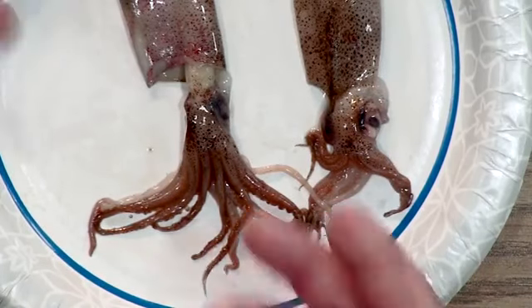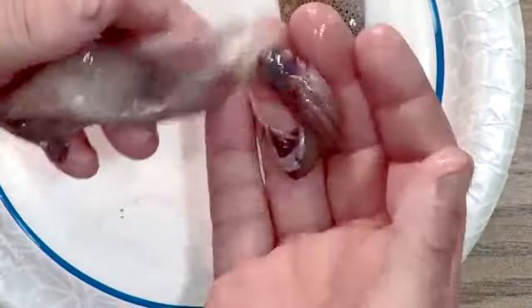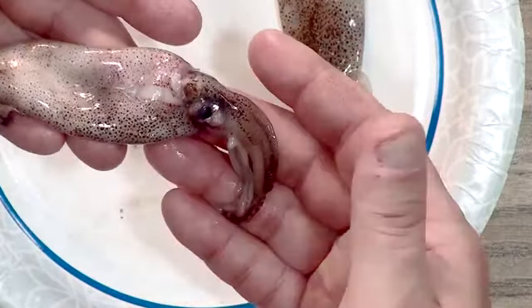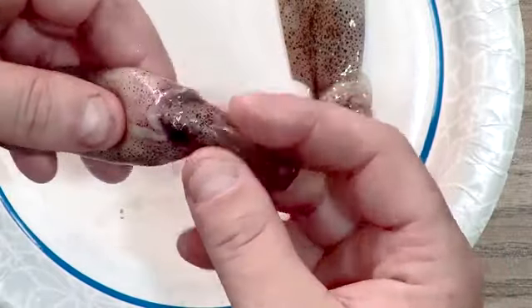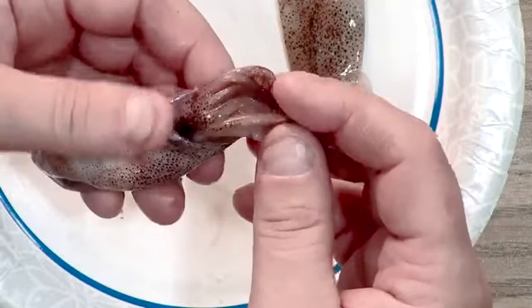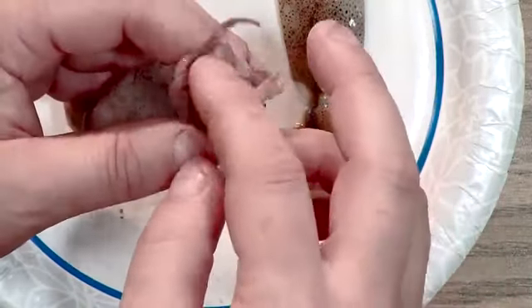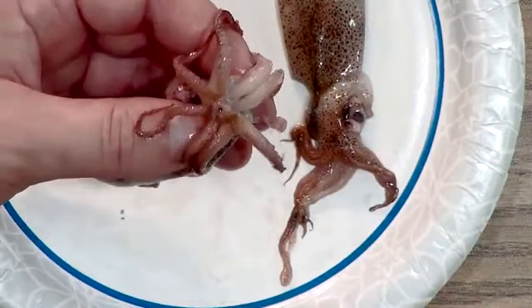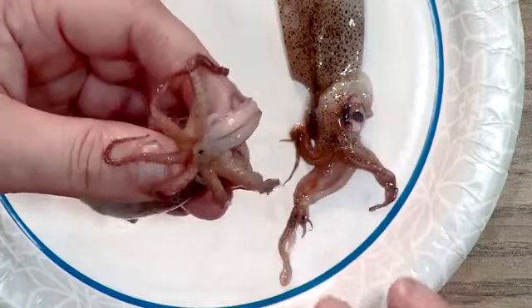And anytime you dissect something like this, the first thing you do is you kind of feel it, and you're like, oh, this is gross. It's slimy. It's touching me. But you just kind of got to get comfortable. And I'm going to get comfortable with this, feel around in my hands without being too rough, because I don't want to damage any of the stuff on the inside. Once I'm feeling comfortable, I'm going to turn it upside down, and I'm going to look at the bottom area here. Now, this is really, oh, it's a great camera shot you're getting of the mouth down here.